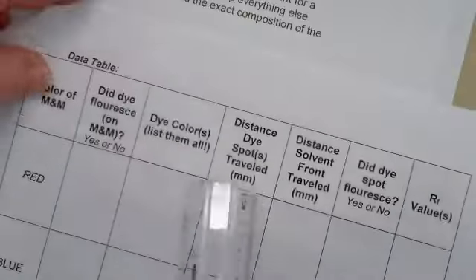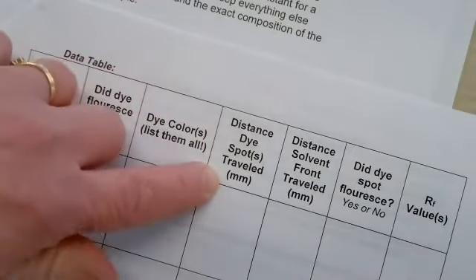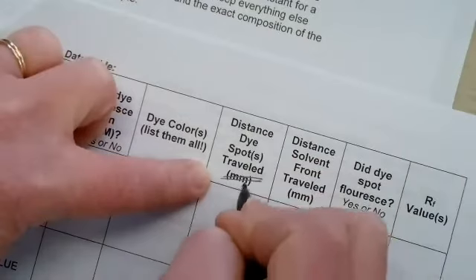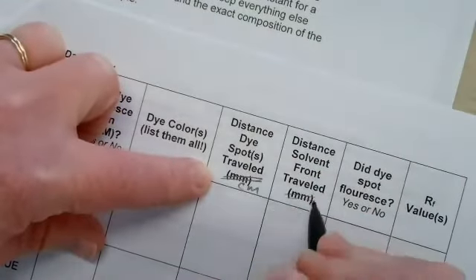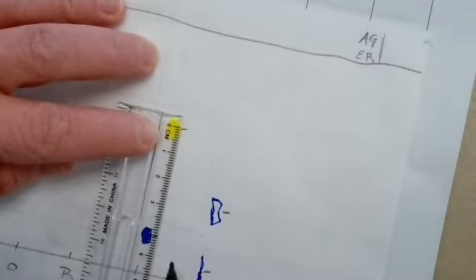Now, the table reads millimeters, but you are fine to be in centimeters. But if I'm going to do centimeters, I'm going to change that. And then for the yellow, I do from start to where it ended, and that will be 5.62.